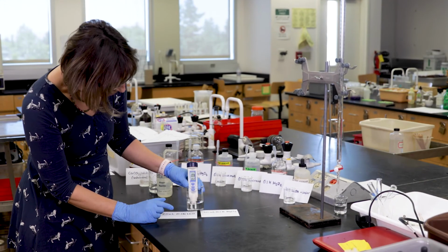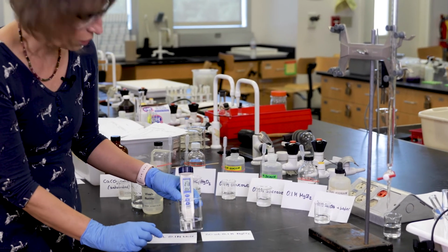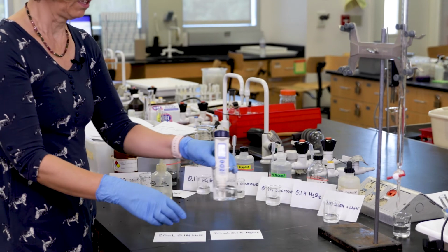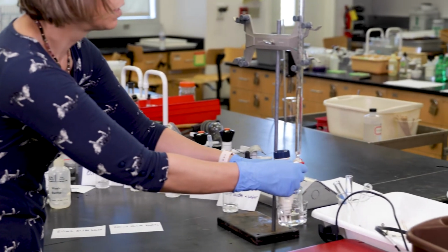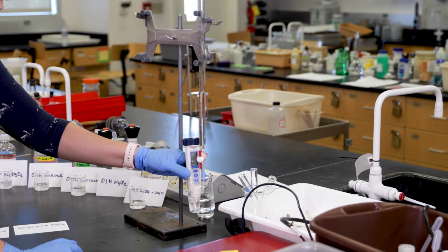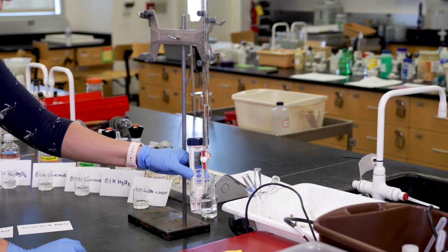So what's our measurement now? 2.15 millisiemens. We add another 10 milliliters of water, so that the water volume we added so far will be altogether 50 milliliters.